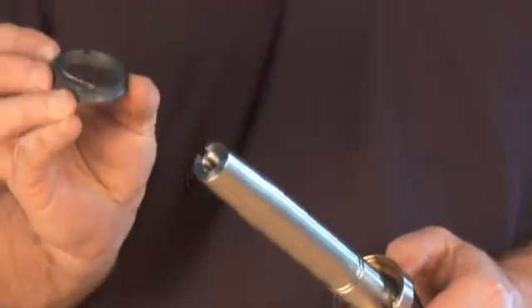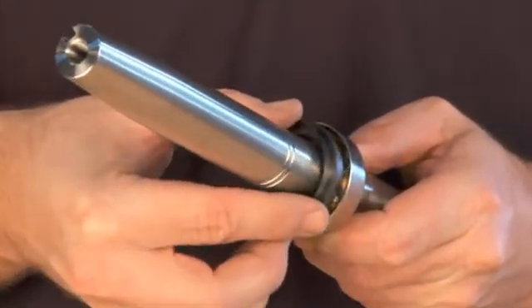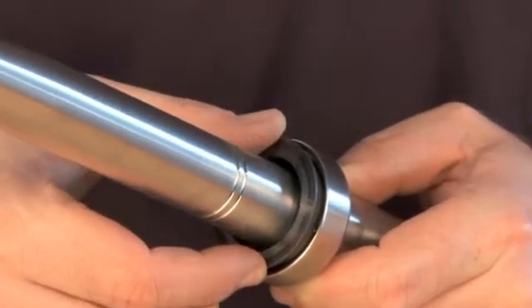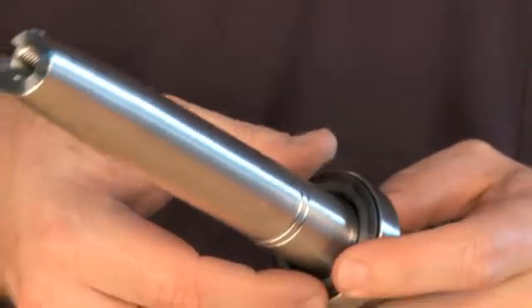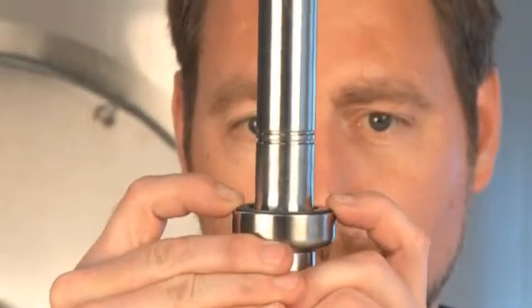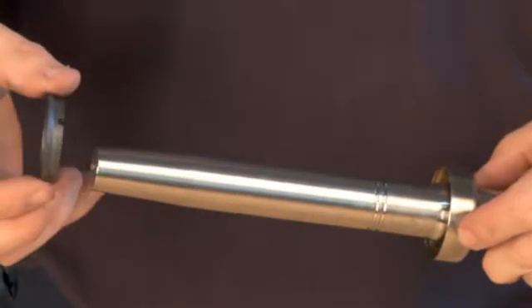Place the rotating part of the seal into the counter ring without an O-ring to check that the height of the pins is correct. Make sure that the seal part does not rock more than shown here. Remove the rotating part of the seal.